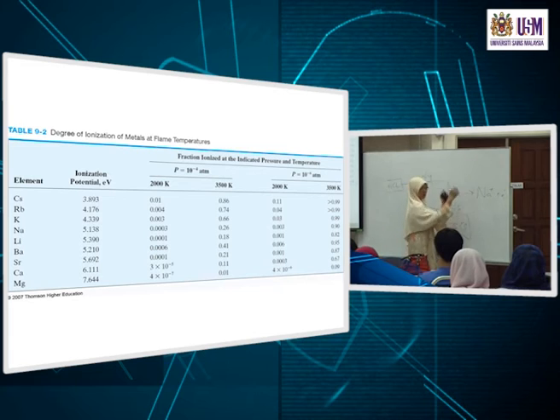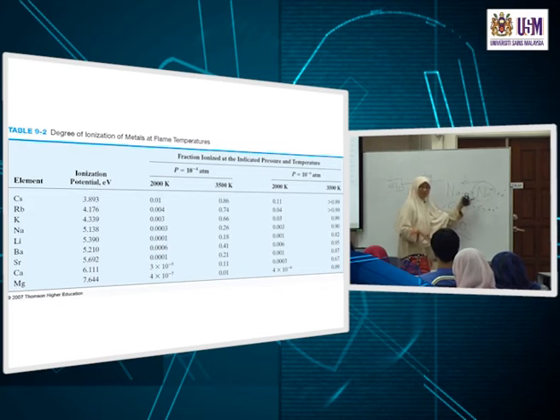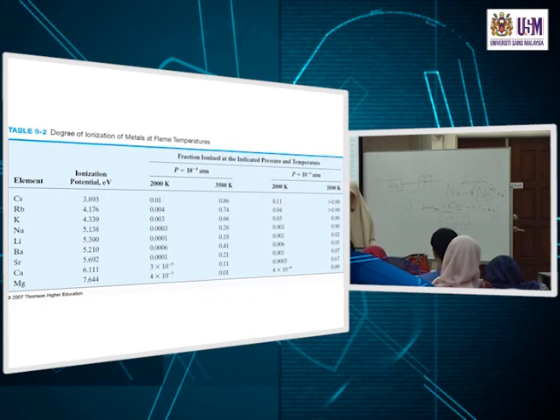All of these will go into the flame. Cesium will also ionize and produce lots of electrons, and it will shift the equilibrium for the sodium, because you have a lot of electrons and not so much sodium ion, since you've added the ionization suppressor in excess. So it is Le Chatelier's principle at work in the flame, so that you shift this equilibrium and suppress ionization of sodium. That's why it's called an ionization suppressor. Cesium salts or potassium are what we normally use. I think lithium is more expensive. Well, cesium is expensive too, but this is what is usually done. Or rubidium, for that matter.